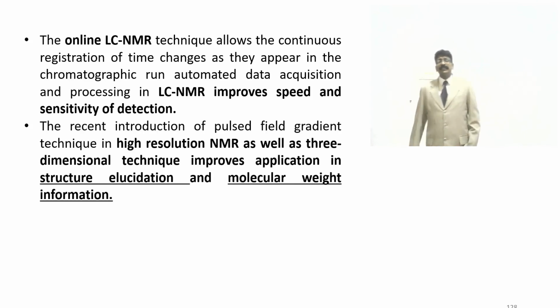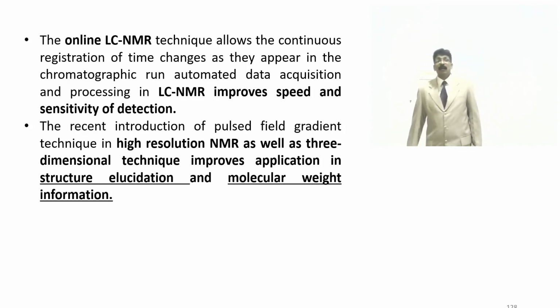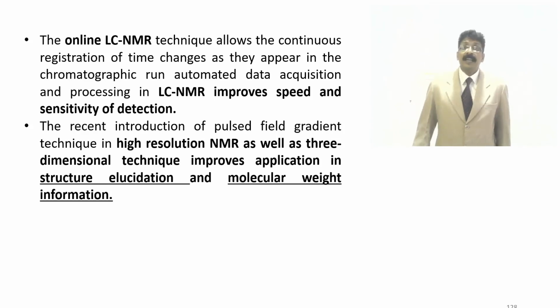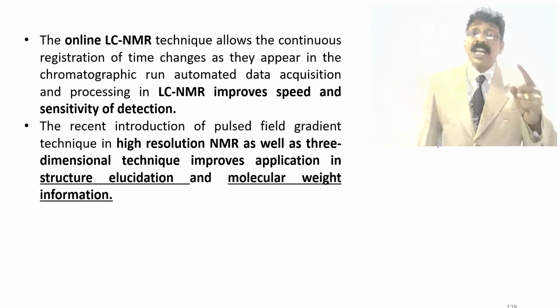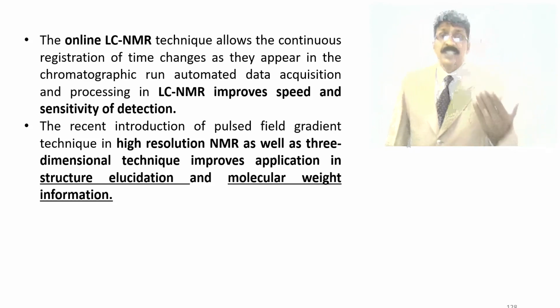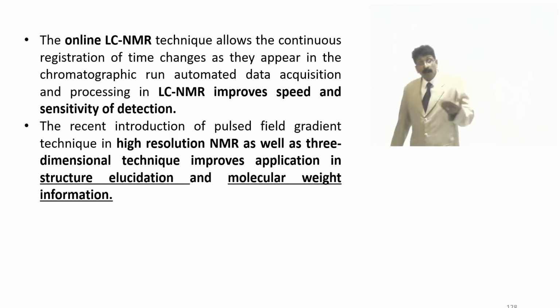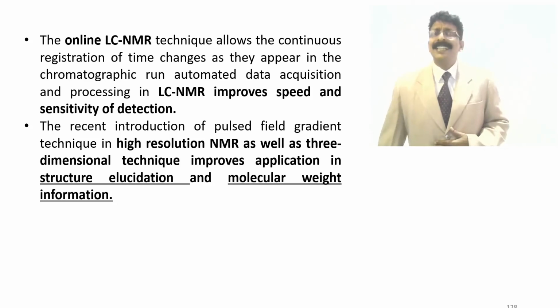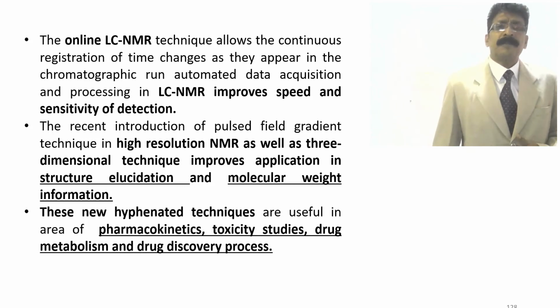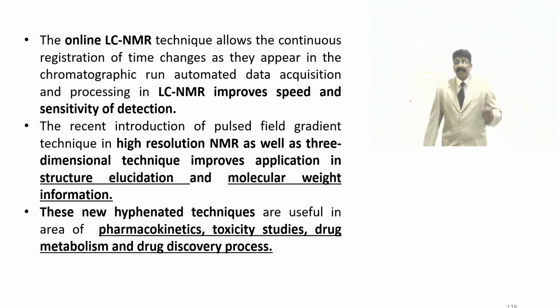The recent introduction of the pulse field gradient technique, high resolution NMR, as well as three-dimensional techniques improves application in structural elucidation and molecular weight information. See how much it has been improved and increased in the structural elucidation of a compound. This new hyphenated technique.